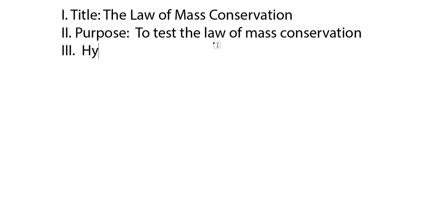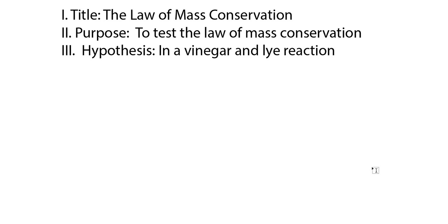If I'm moving along too fast for you, feel free to pause the video and catch up and then start it up again. Every lab should have a hypothesis, what we think is going to happen. So, in a vinegar and lye reaction, mass will be conserved.